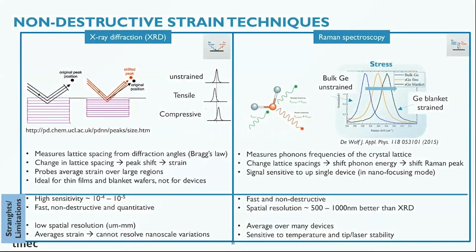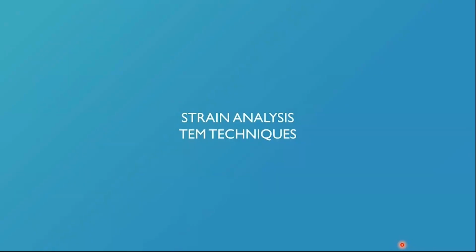And now I will pass to strain analysis by TEM techniques.